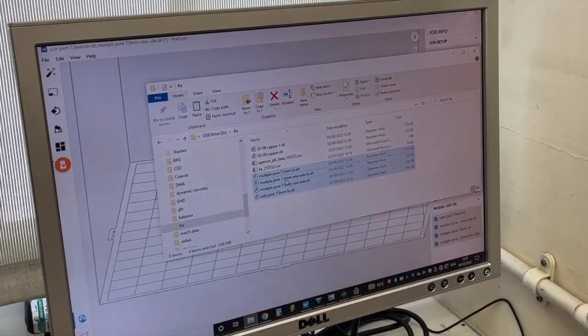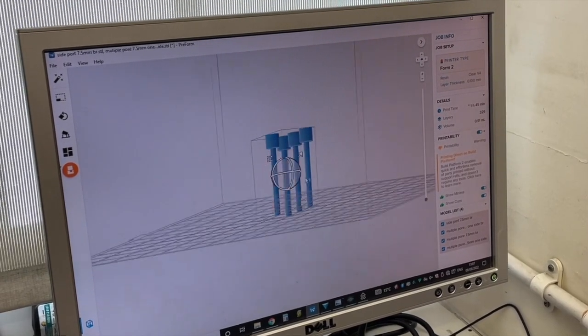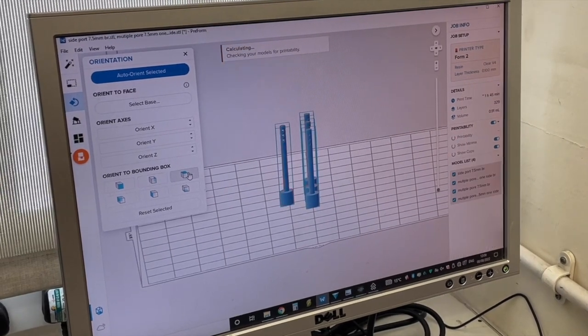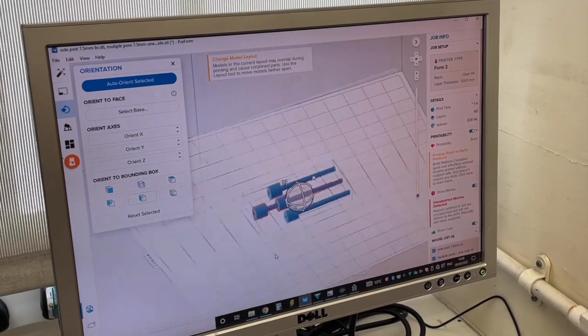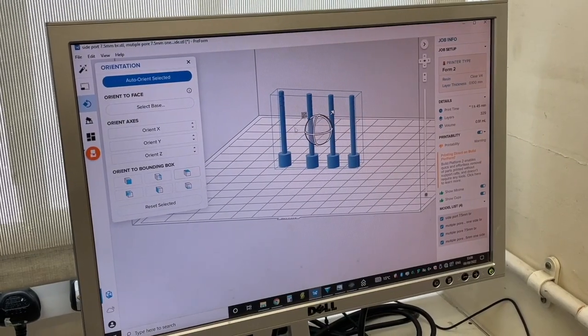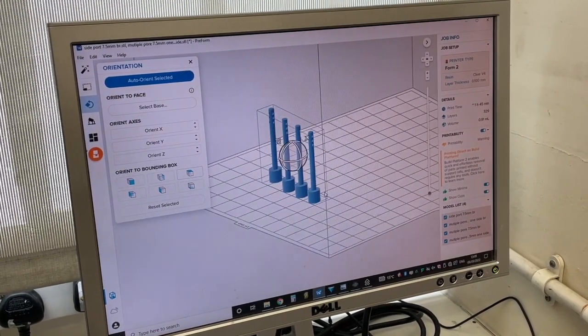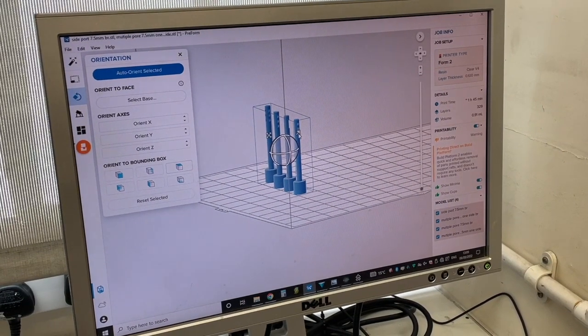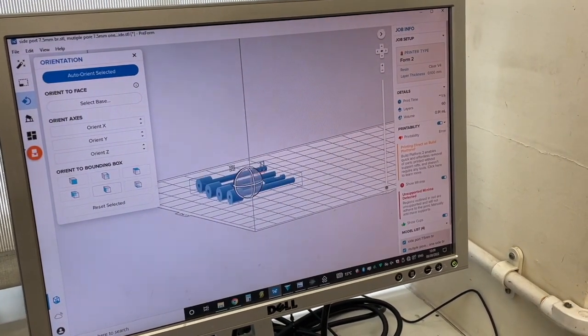Let's look now at how we can actually print our own medicines. Like with all 3D printed products, we have to design the object we want to print in CAD software. The object is imported from the CAD software into the printer's driving software. Several objects can be printed at the same time — they just need to be able to fit onto the printer's build plate. Once imported, the object can be moved on the build plate, resized, and placed into different orientations. Sizing is one of the ways we control the dose of a printed medicine. Obviously, the concentration of drug in the resin is fixed, so by increasing the size of the object, we increase the dose.